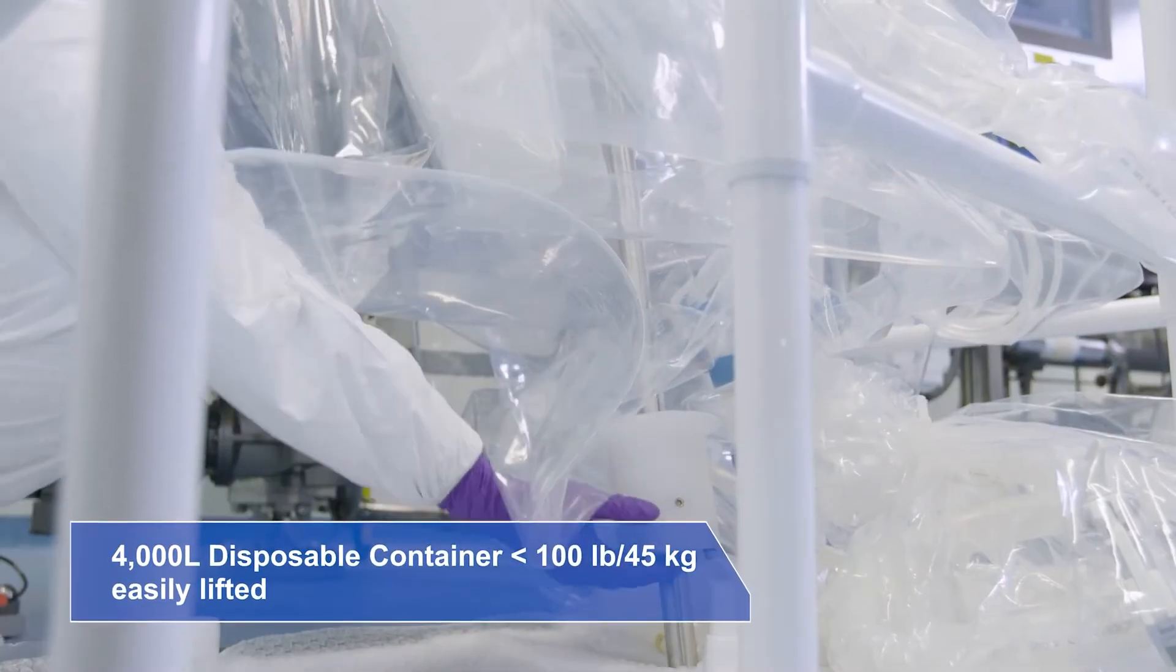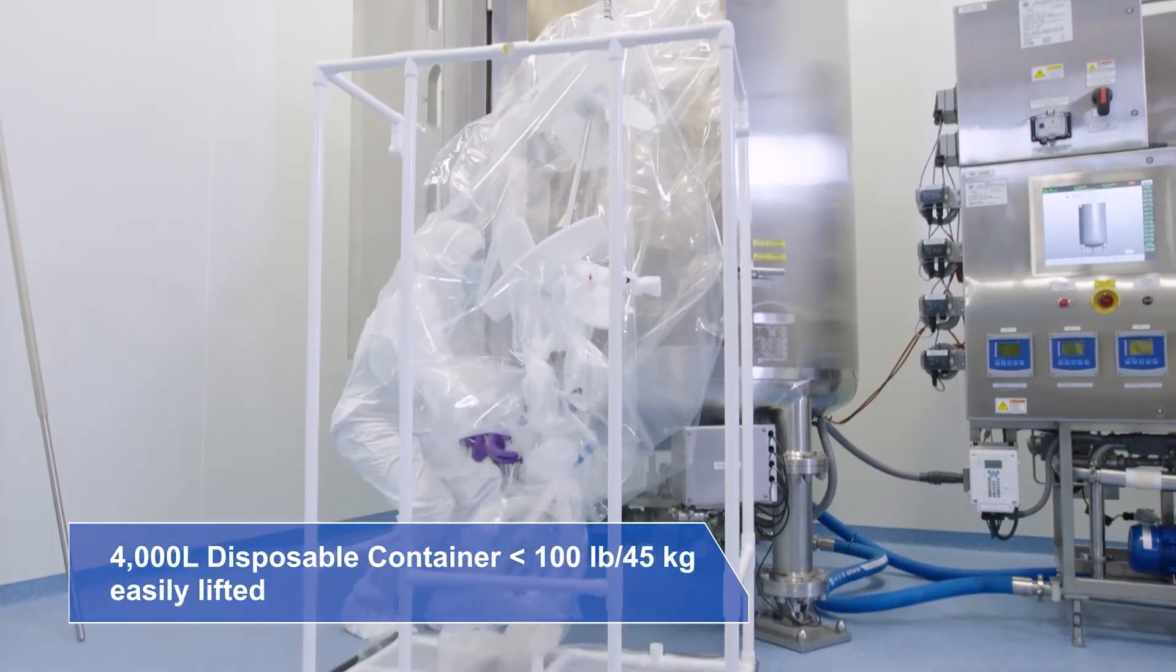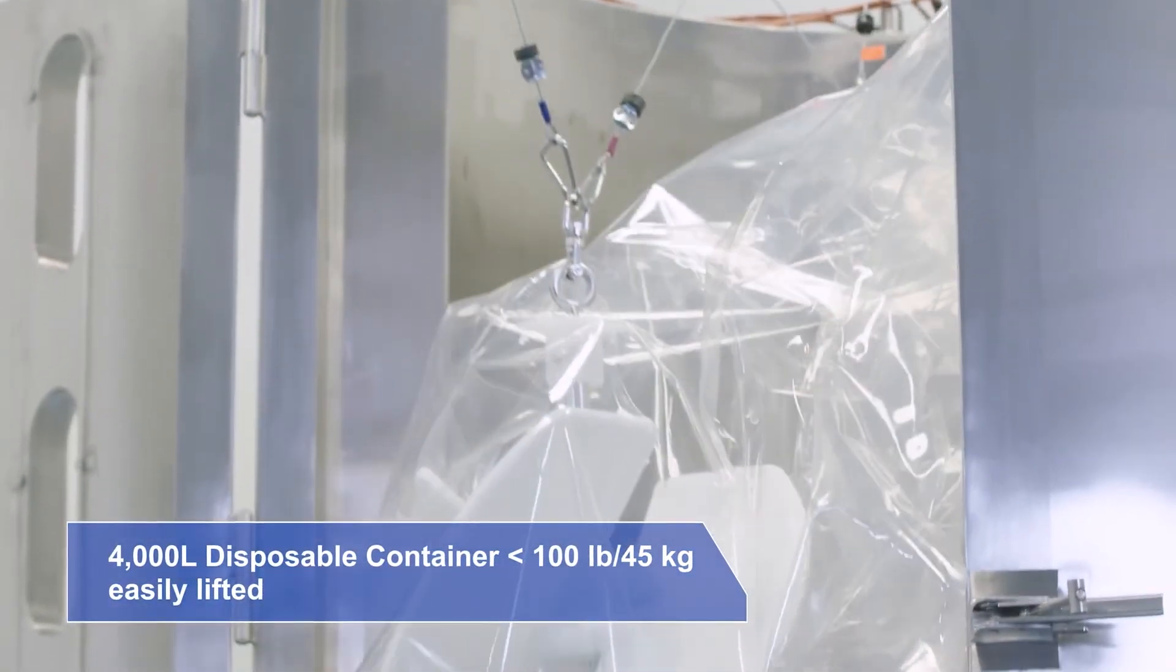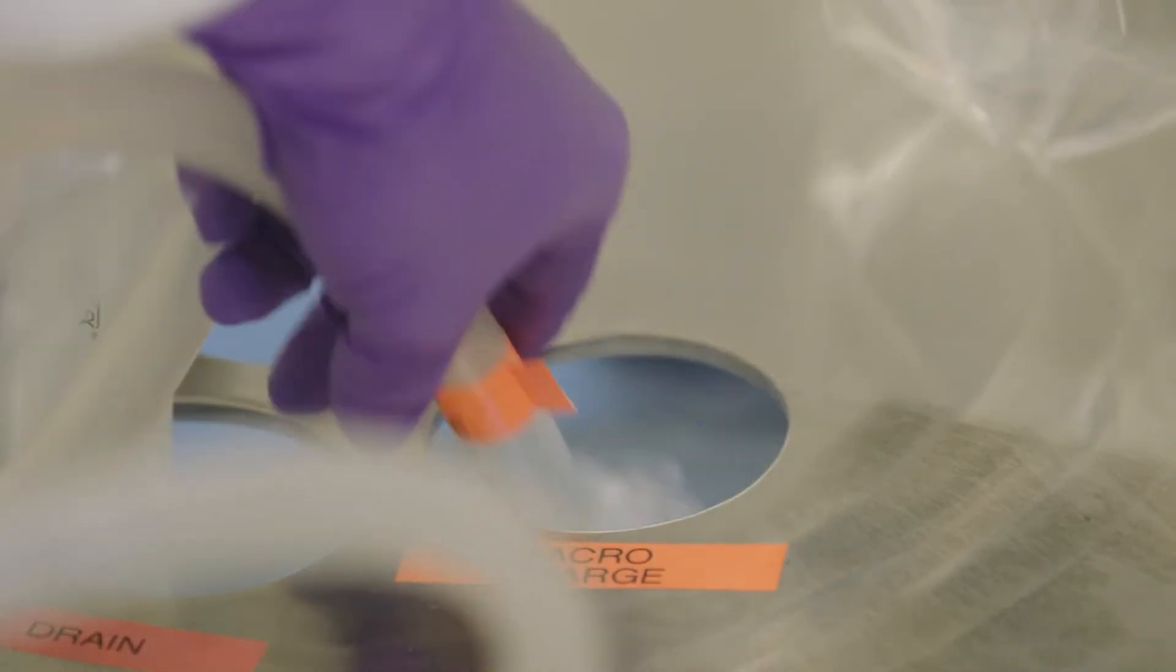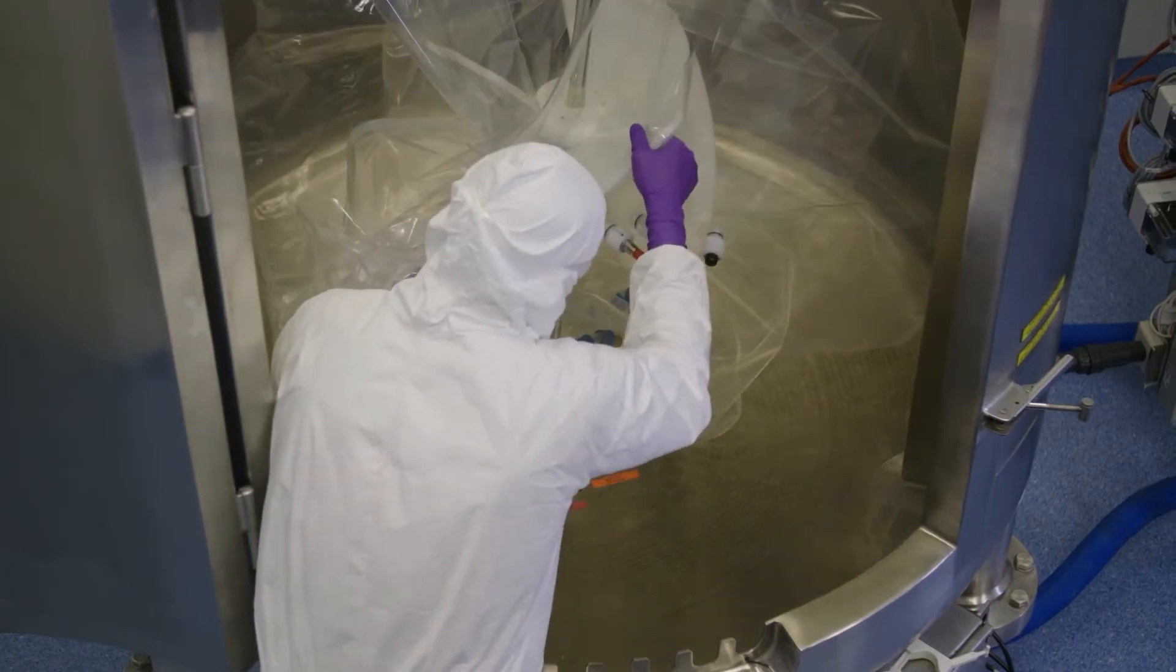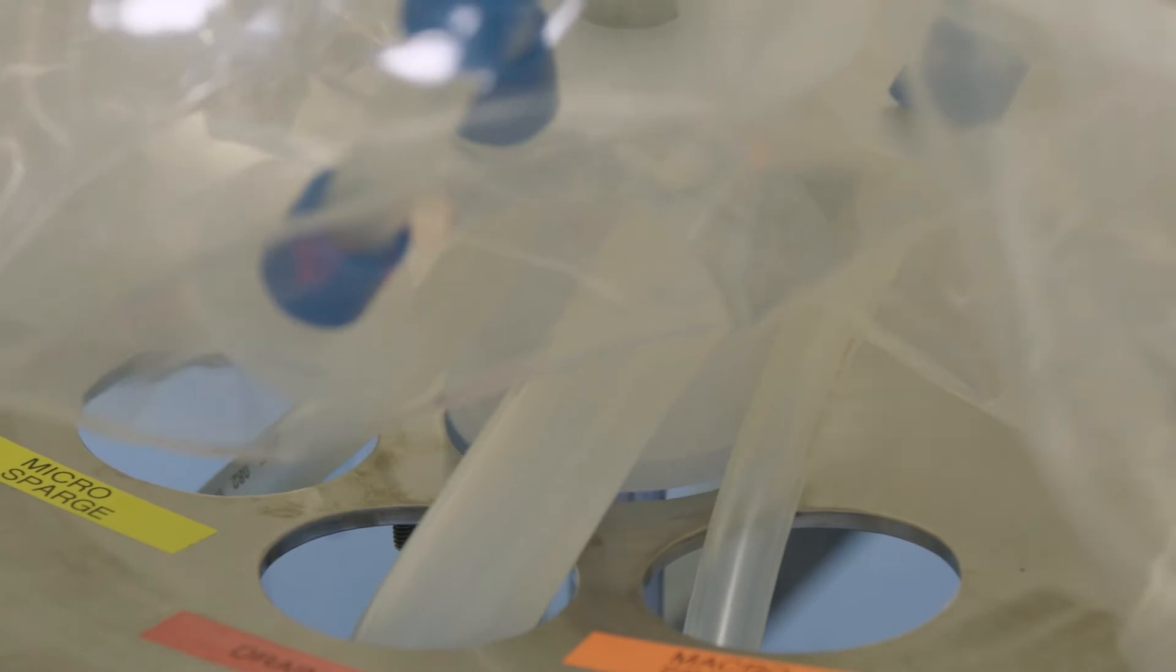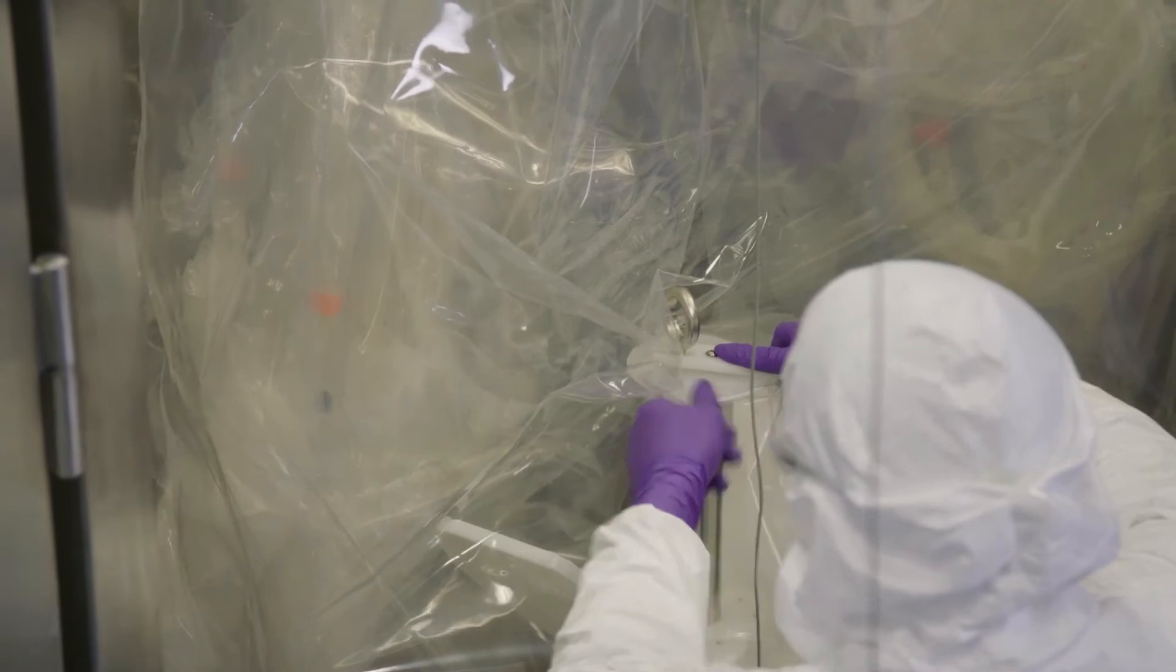Designed to easily lift the disposable container into the bioreactor holder, position tube sets into the bottom of the bioreactor.